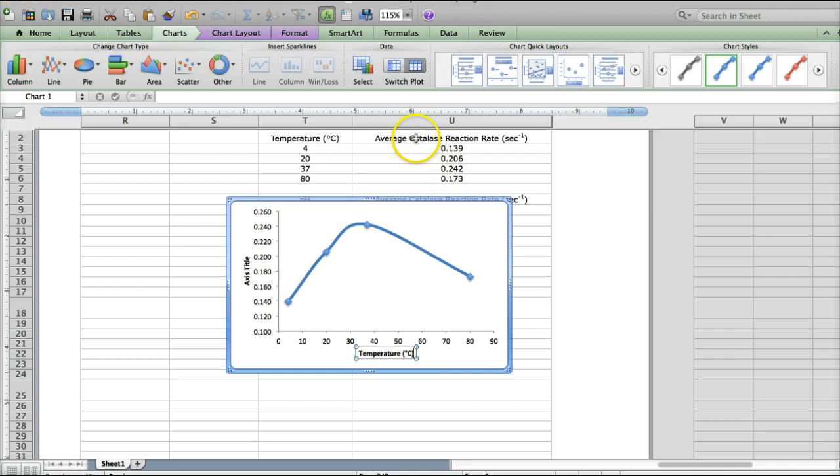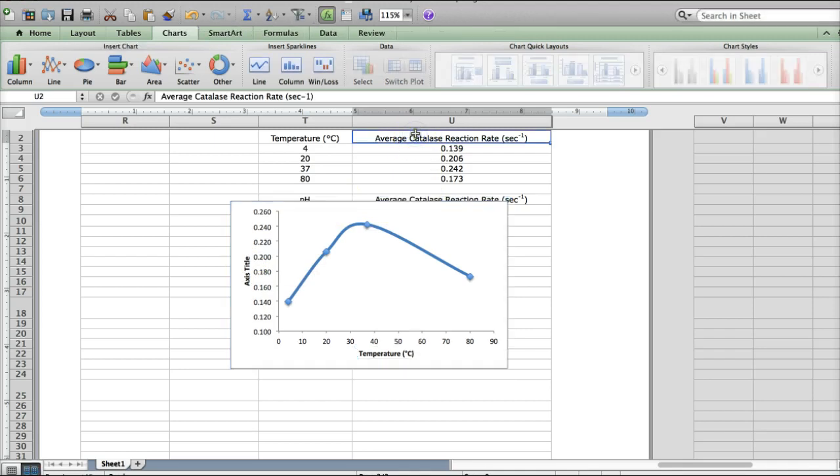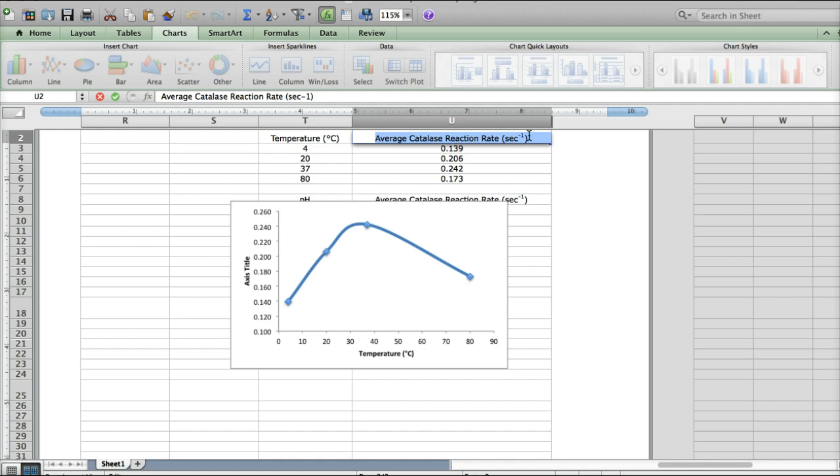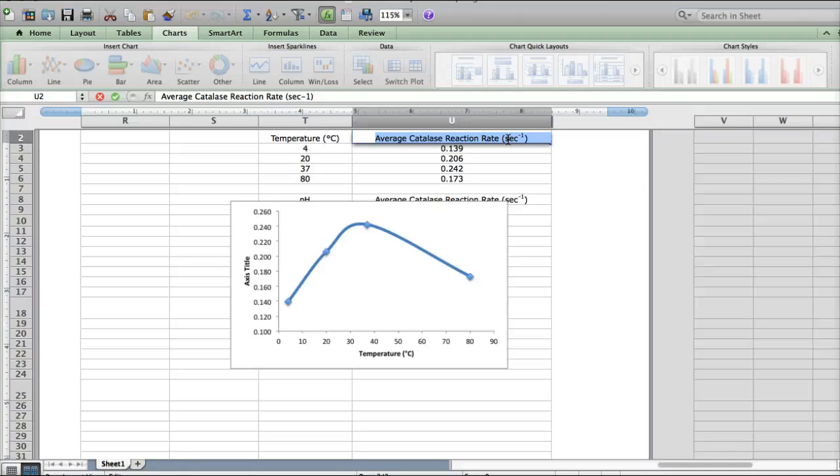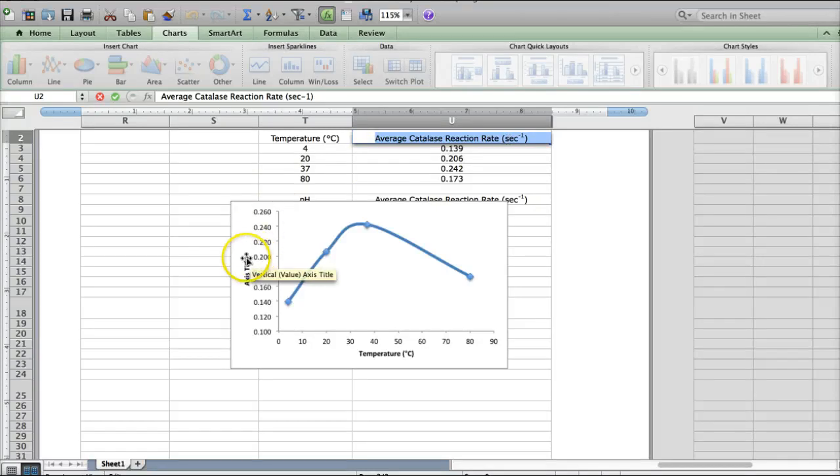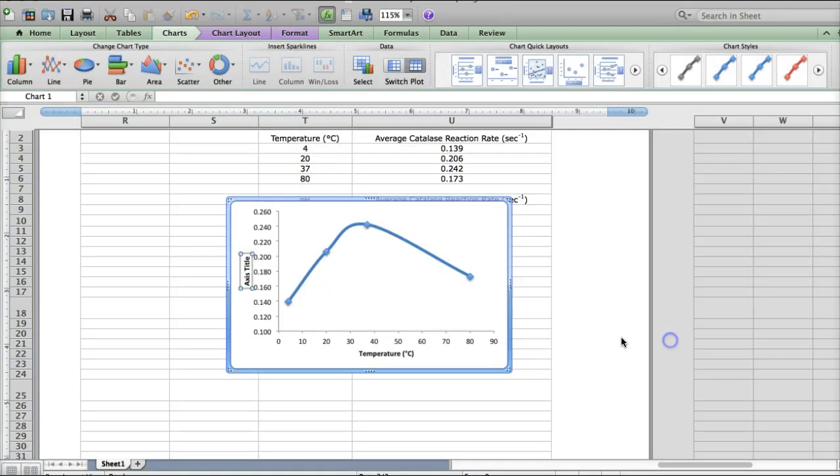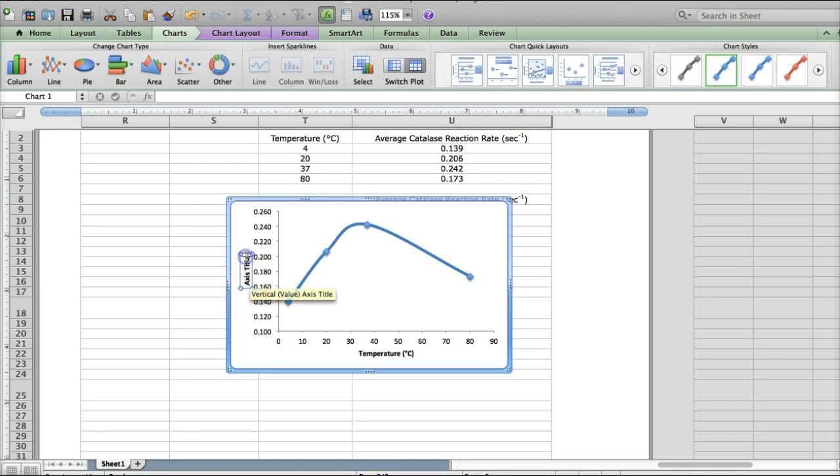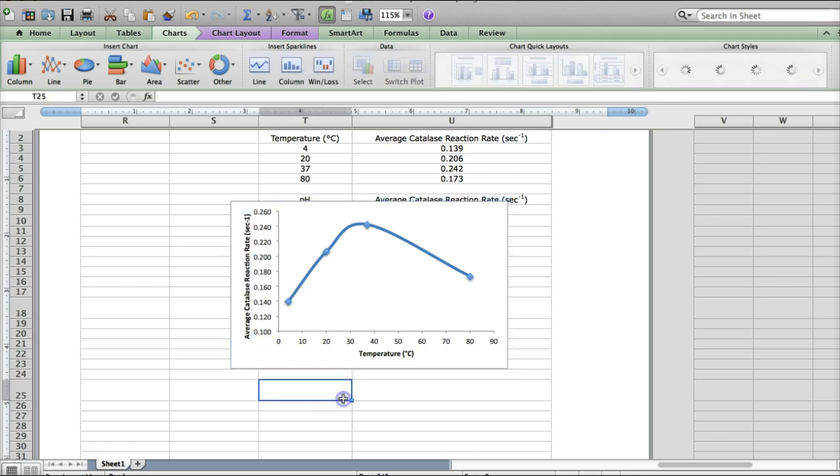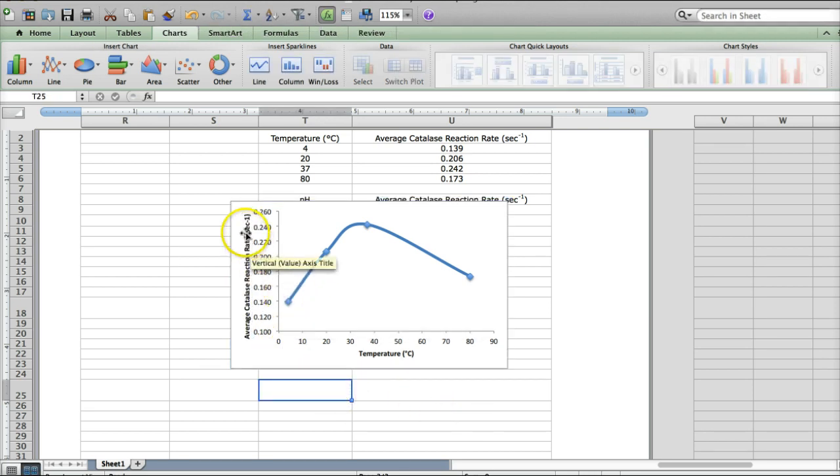On this side, it's measuring the average catalase reaction rate, and rates are always 1 over seconds, which you'll, if you didn't learn in chemistry, you'll definitely learn in physics. So we're looking at the rate at which this enzyme catalyzes the reaction. Copy that, and paste it into this little box here. Select all these words, which is a little tricky, and paste. There we go. So now I have my axes titled.